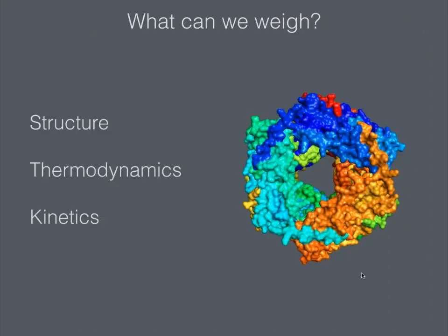So just as a way of summary, I hope I've shown you a little bit about how we can use mass measurement approaches in biophysics and structural biology, namely native mass spec and mass photometry and their combination to understand the structure, thermodynamics, and ultimately kinetics of protein assemblies.